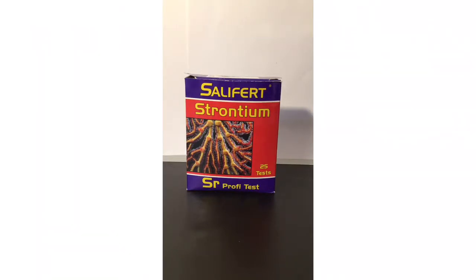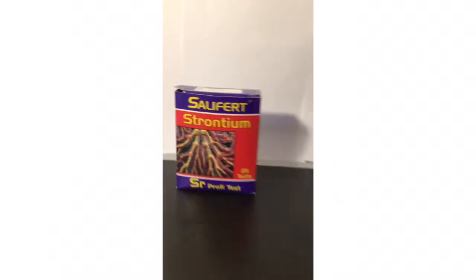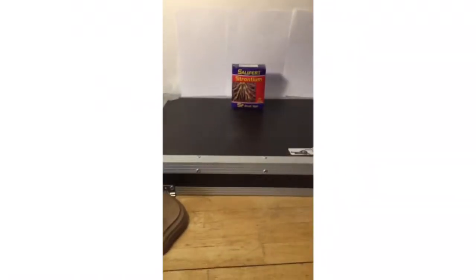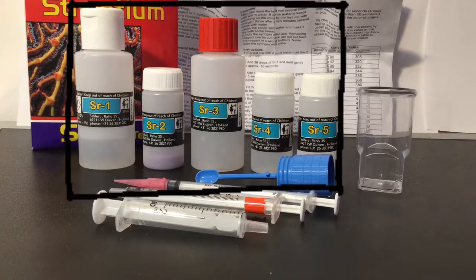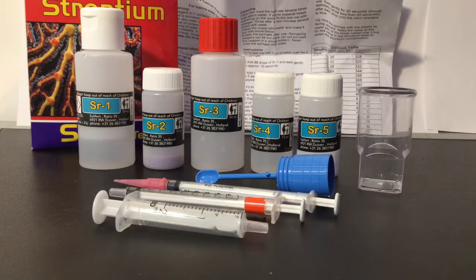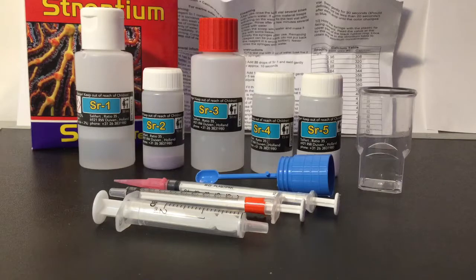Here's how I made this instructional — just a nice-looking backdrop, a cover to one of my boxes, and a light so you can see what's going on. Here are the contents inside your strontium test kit: five bottles labeled SR1 through SR5, a blue measuring spoon, a labeled syringe with red tape on it, an unlabeled syringe with a pink plastic tip on it, and your water sample syringe.